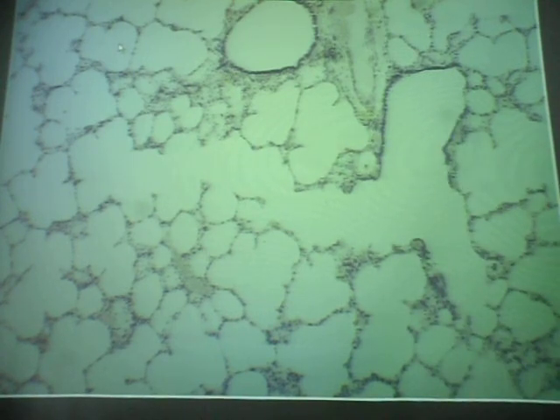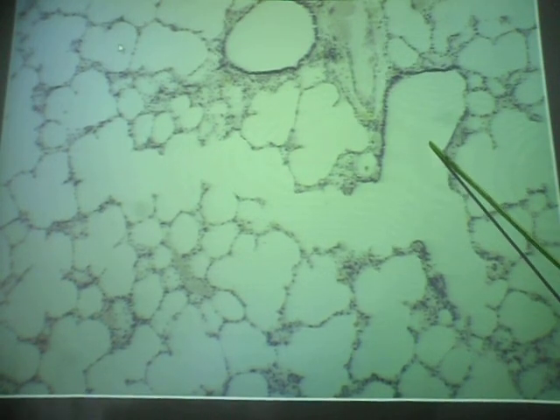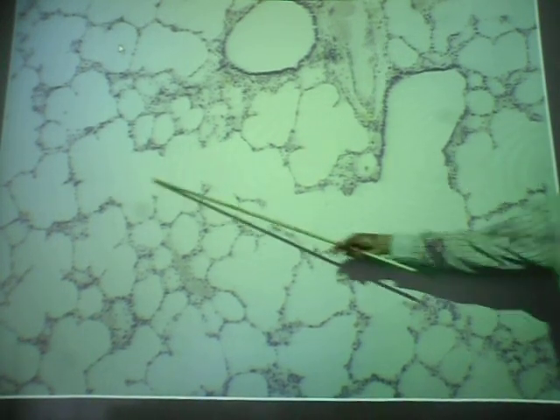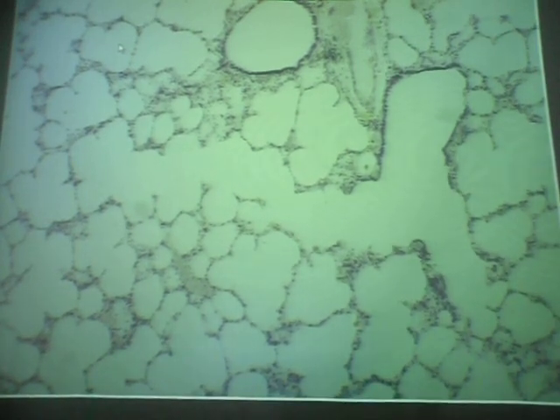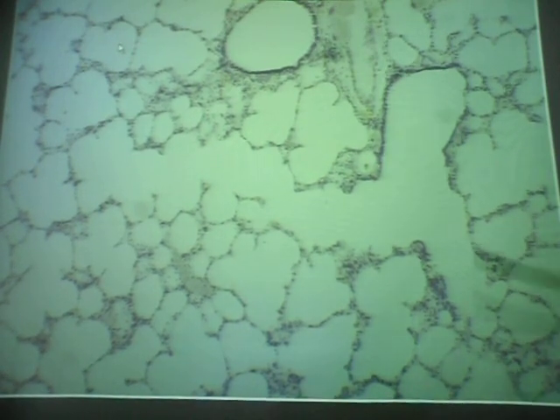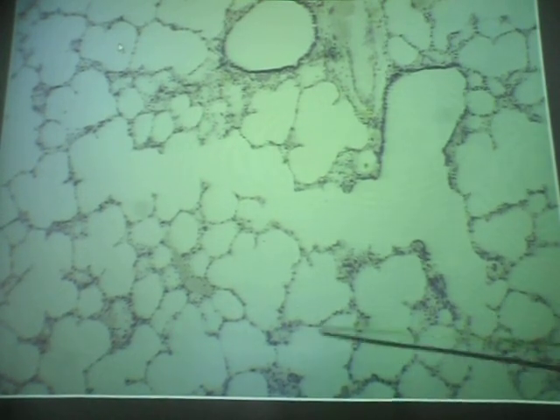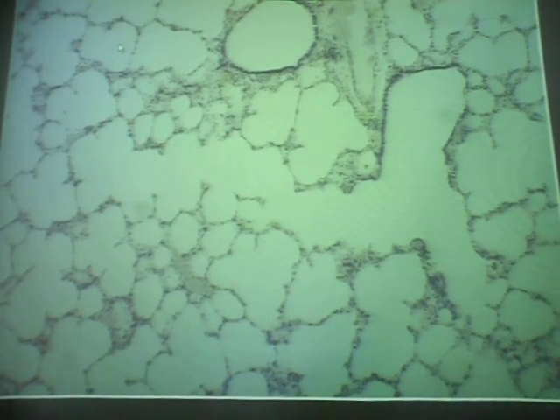So that line going down, is that the duct? What, here? No, the long one. Yeah, this is an alveolar duct. Very nice example. And here's another one here. Remember, this is three-dimensional, so it may have gone off the plane of section too. That's why it's much shorter. But you can see alveoli all over the place. Okay. Any other questions on this?